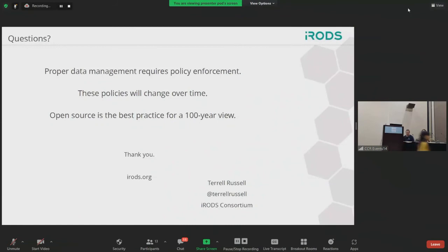All right, thank you. So we have a question from Elke, and this is for Valeria. Is the OMERO server managed or maintained by Glencoe or by your local IT team? I think it's a combination of both. Glencoe would be the main manager of the server, so they do the updates and restart microservices if needed, but they're slowly teaching us how to do it, which is great. When something happens and we need a fast response, NYU IT can do certain kinds of restarting processes so that it would fix a little glitch.